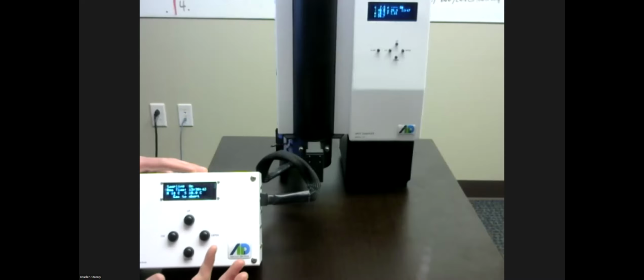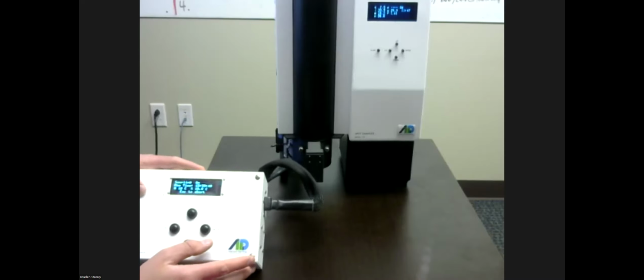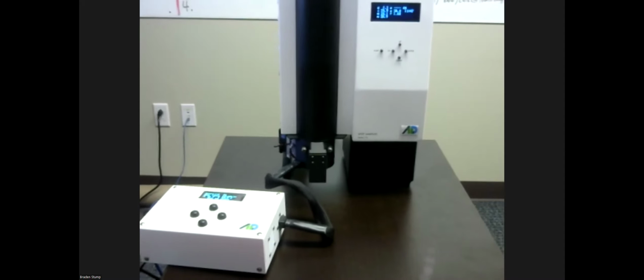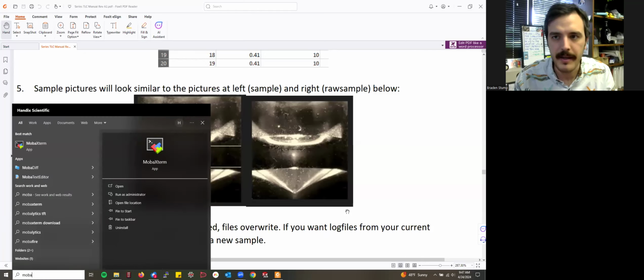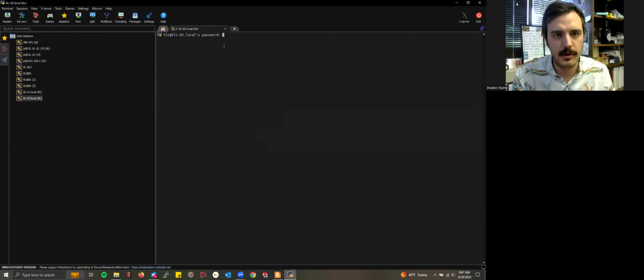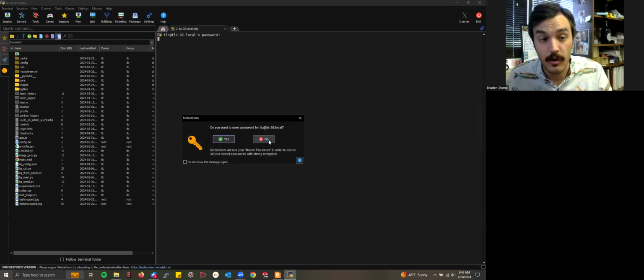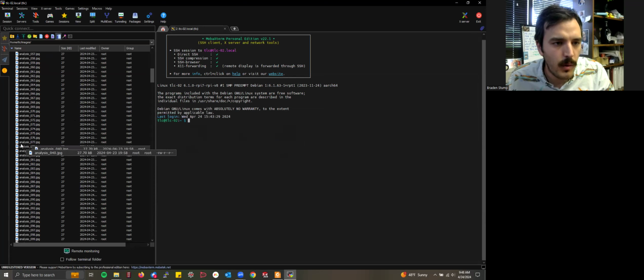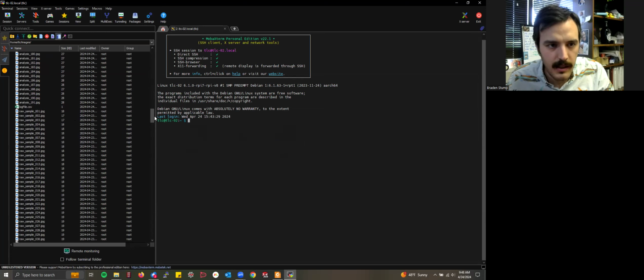So effectively, this is what happens when you're doing this sample, and we'll look at log files actually while it is operating, because I think those are pretty cool. One moment. So going to turn camera towards me. While this is operating, we actually can utilize tools. This isn't necessarily the primary tool you want to use, but I want to be able to look at pictures quickly here. So when you're entering stuff in, you will be able to communicate via settings that are in the manual. We'll be able to talk about that if you get an instrument and have more intense training. But I wanted to show what sort of photographs of vials you're going to see. This is the picture of the vial that we just got.